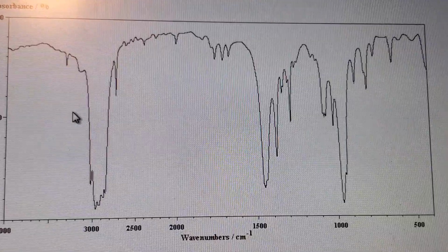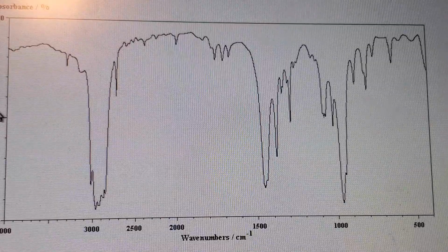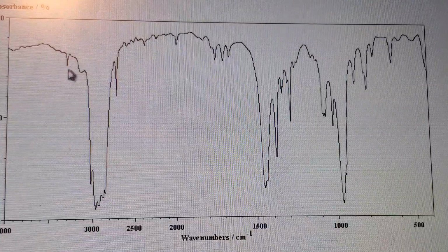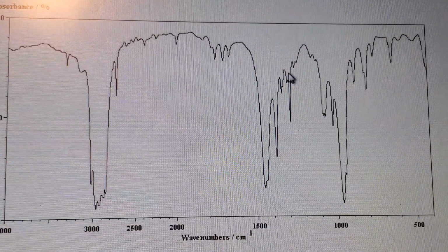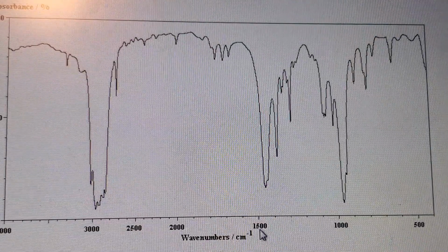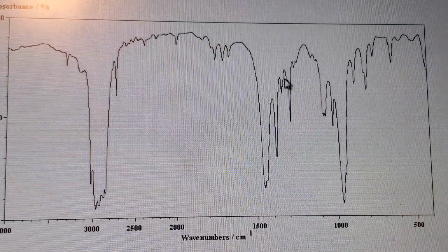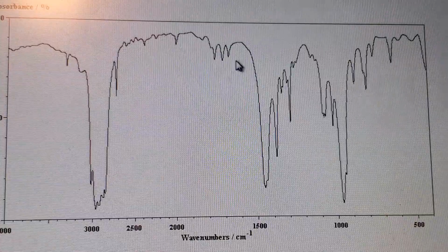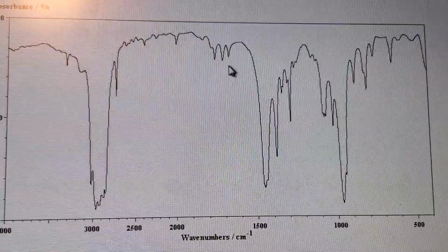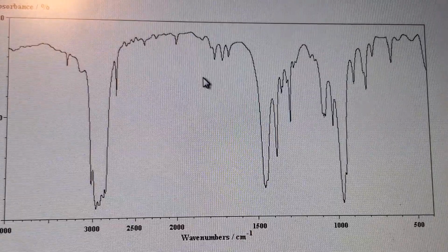Okay, so here you have another spectrum. What do you see? I wouldn't give any consideration to these small peaks yet, especially the peaks under 1450, this region with the small intensities. I'm not going to try to assign them unless I have some sort of quantum mechanical reference about the symmetry of vibration modes.